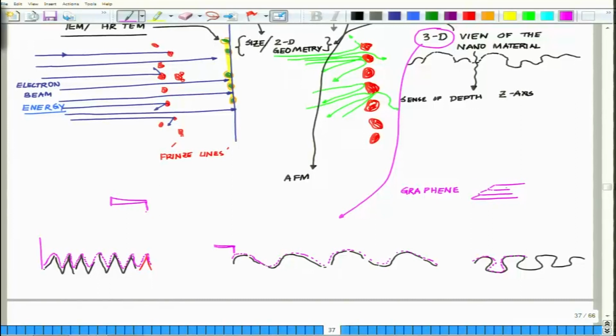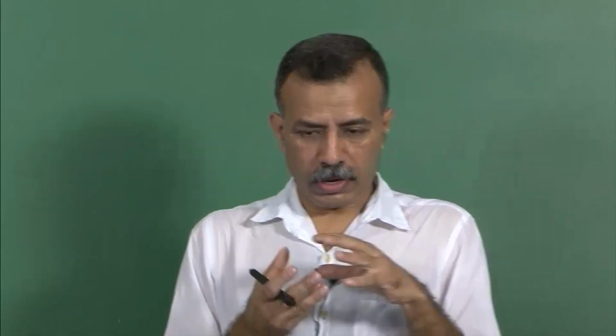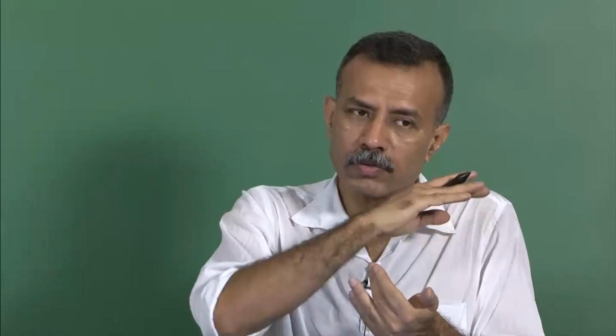So, that is the power of this technique. This technique can give you, at times, are the particles aggregated? If they are aggregated, then it should be able to tell you that this is the kind of change in depth which is happening in a layer. So, it means these are multiple layers, and it is able to scan through it very neatly, its probe.